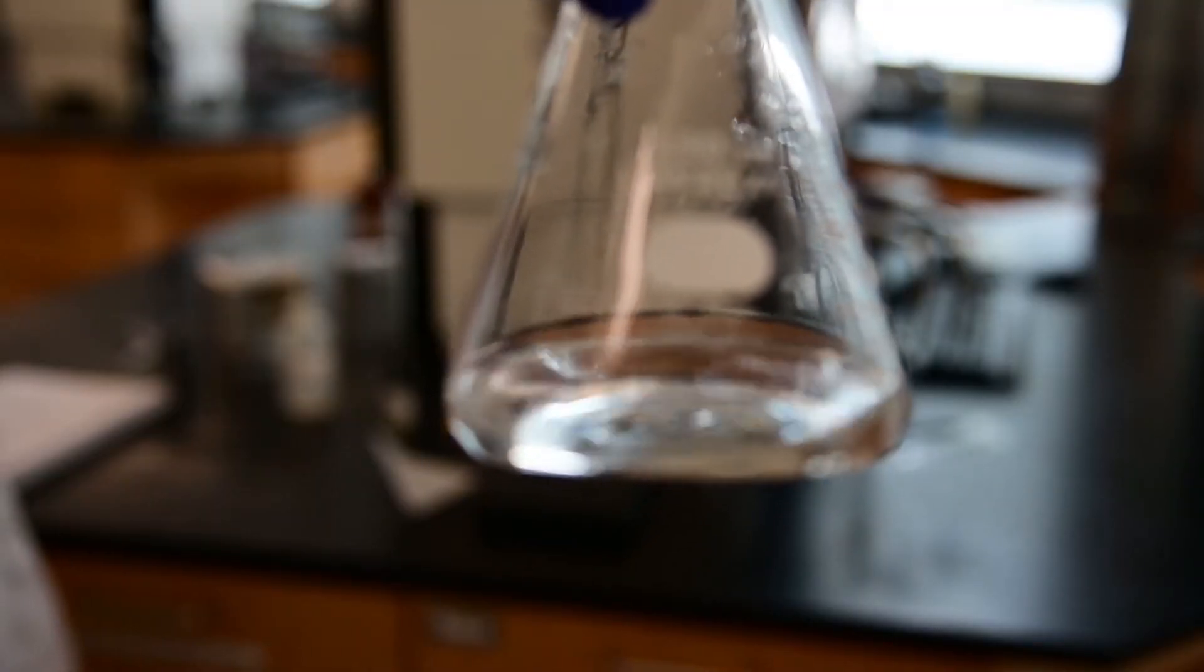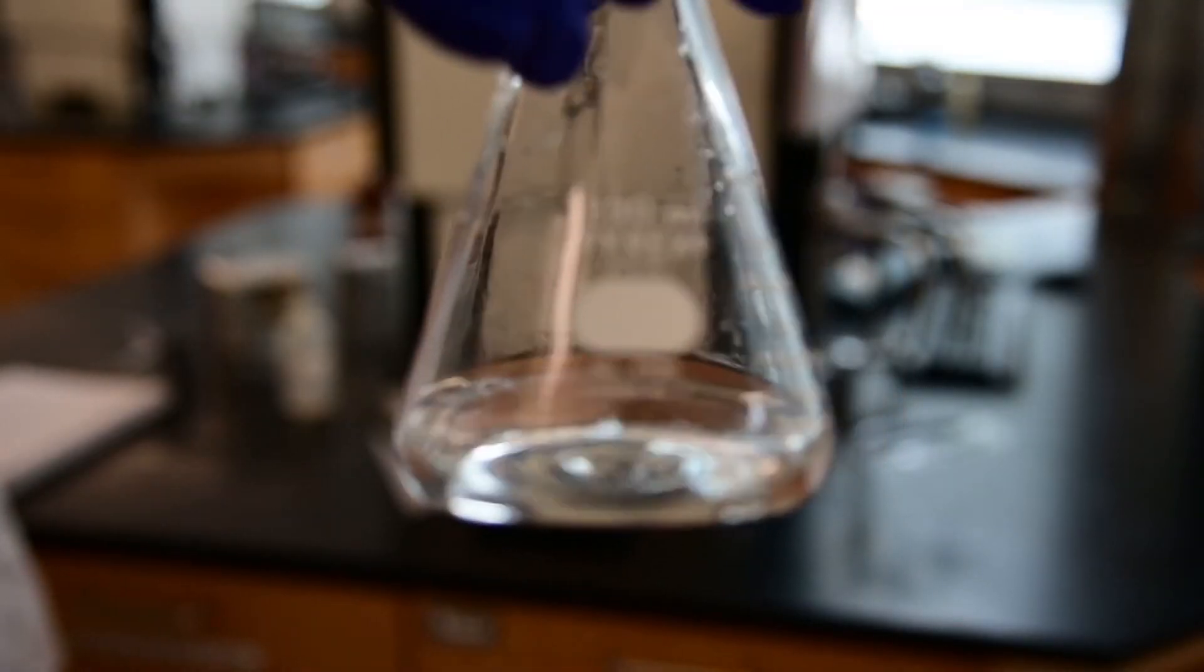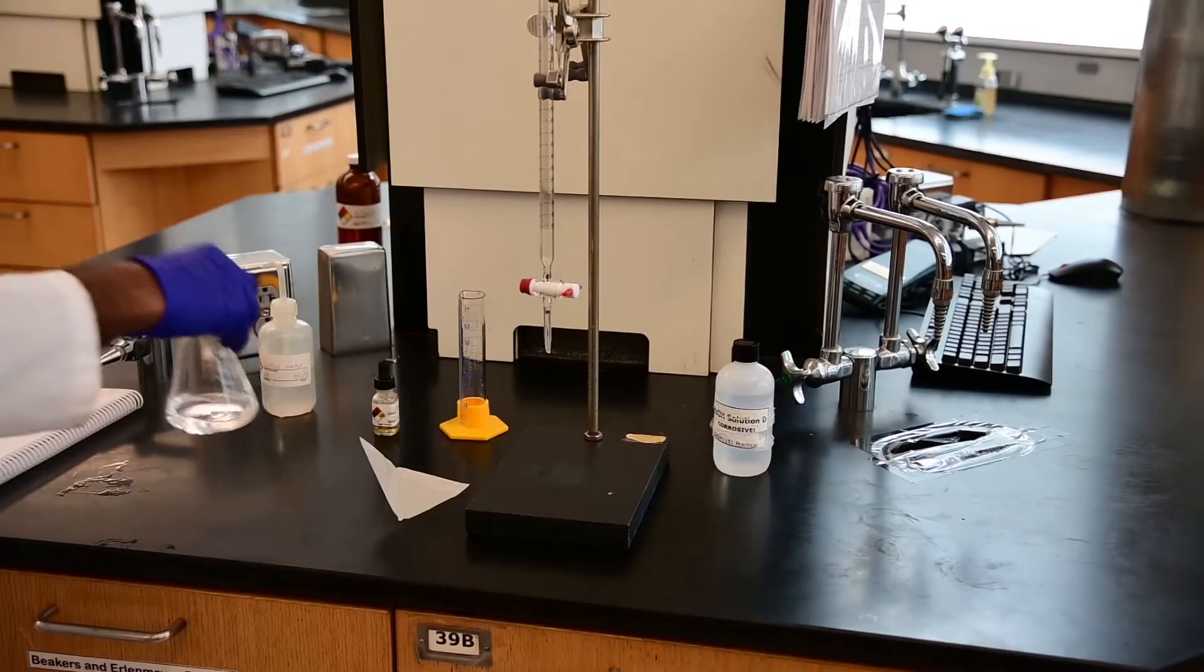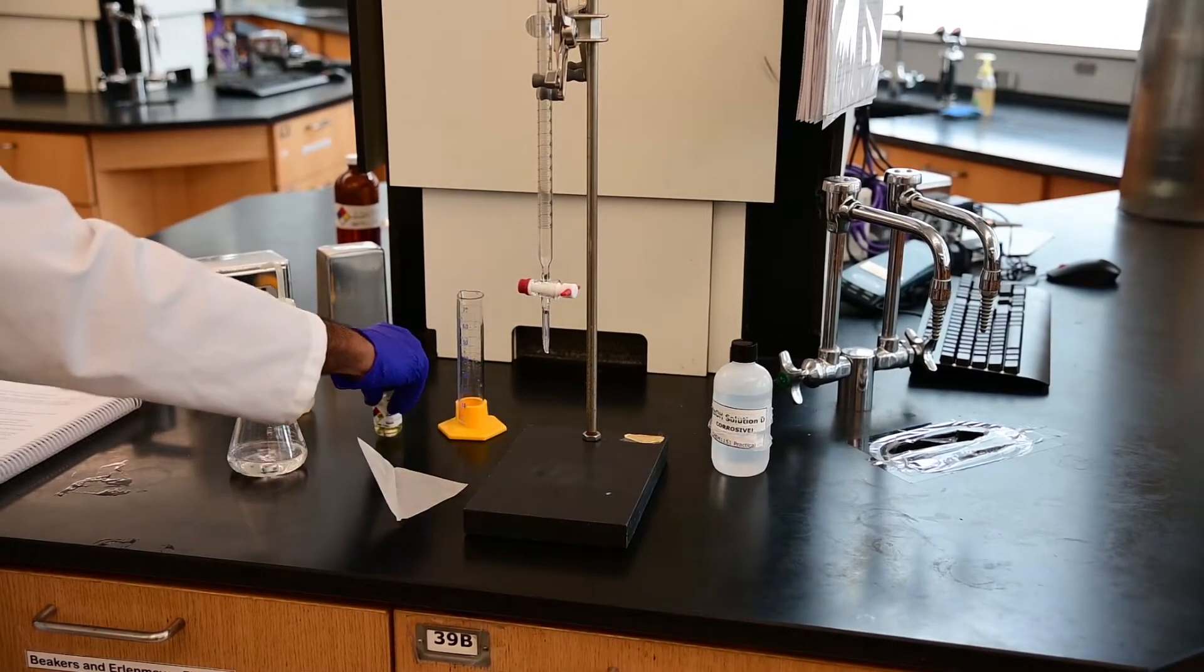There is no solid residue left in the bottom of the flask, so the flask is ready for use for the titration experiment. There is one vital thing we still need to do before we can start filling the burette, which is to add the acid-base indicator.